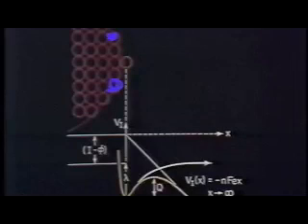So what you will see in the videotape section is these edge atoms disappearing, then the next atoms being imaged, and then those disappearing, and finally one atom or so left in the plane, and then that disappearing.